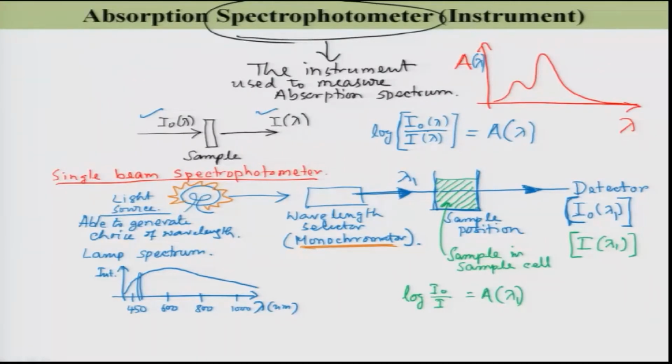First of all, the lamp I showed over here, let us say the tungsten filament lamp.